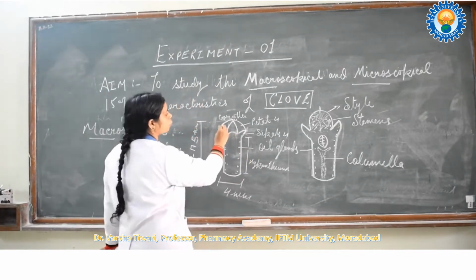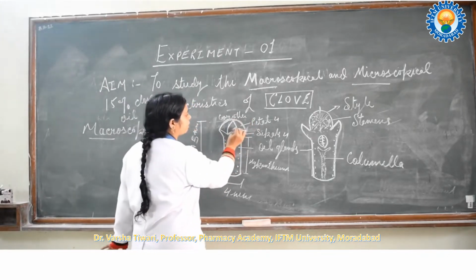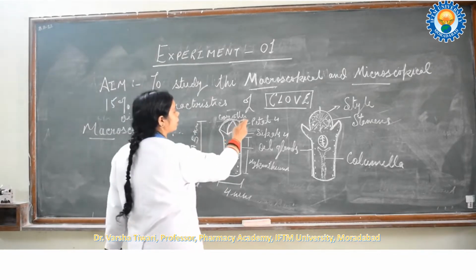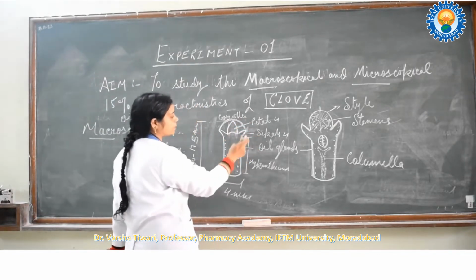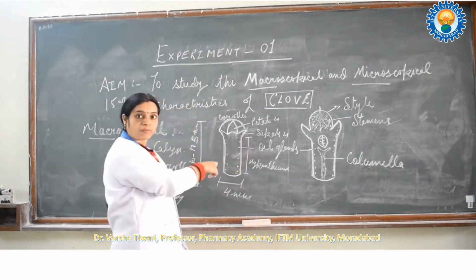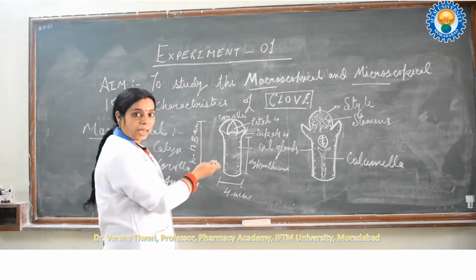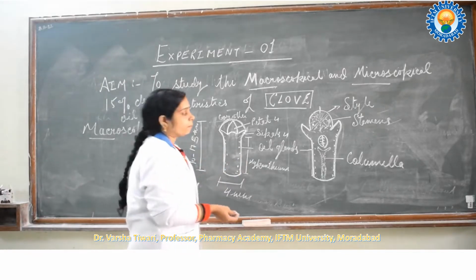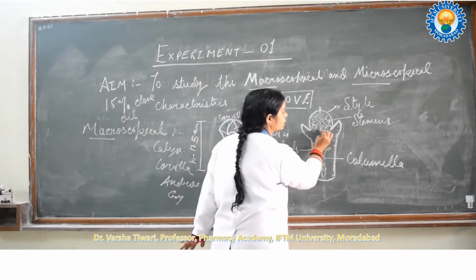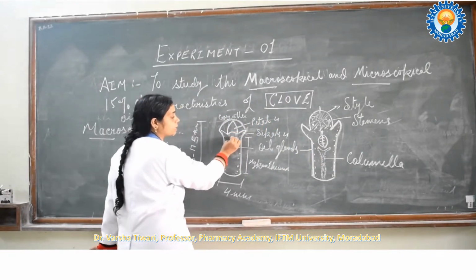You can see this dome-shaped structure. This dome-shaped structure is the corolla, and these are the petals. Petals come above the calyx. So corolla, petals, and these are the sepals. And this stalk is called the hypanthium, which contains the oil glands. So clove oil is present in the hypanthium portion, and this is the ovary, gynoecium. In the gynoecium, the ovary is present just beneath this. Here, if we look, the ovary is present in this region.